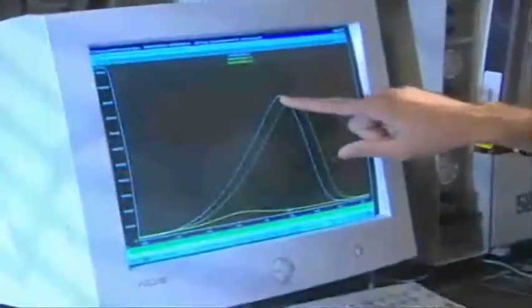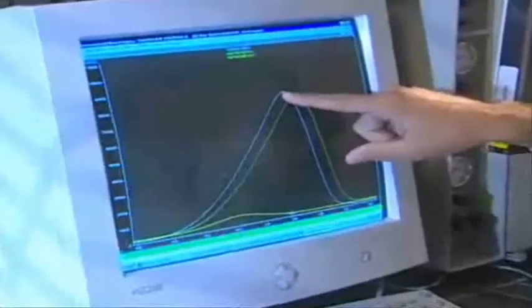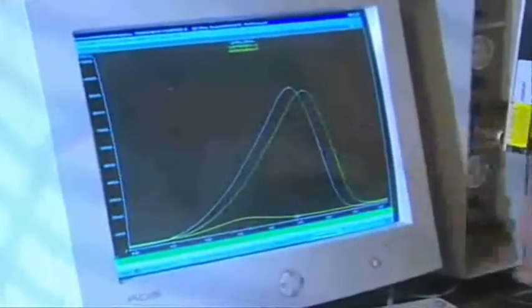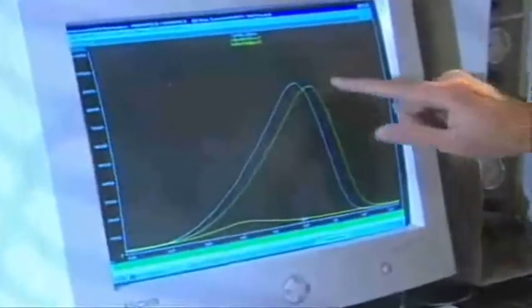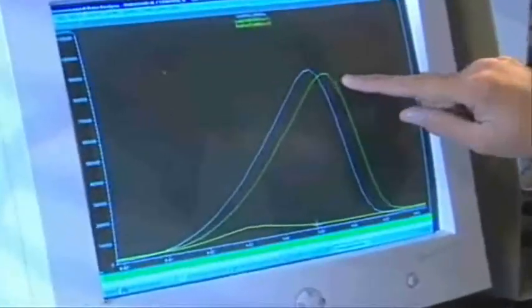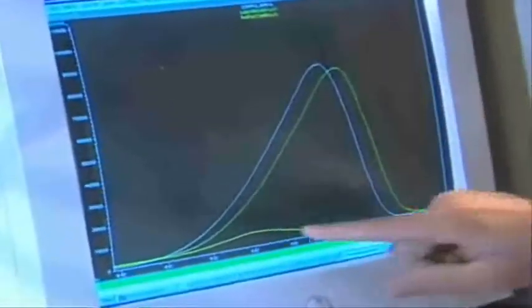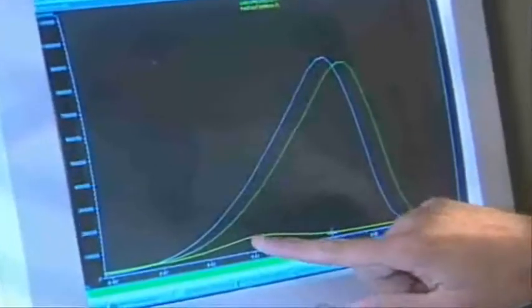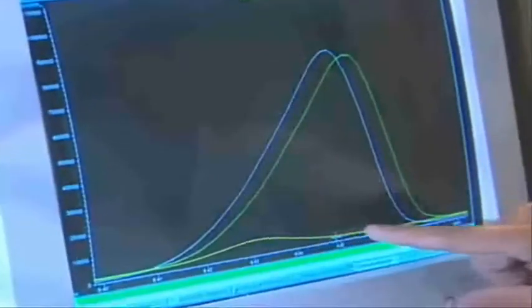This is our control: parathion in the solvent without any treatment. The second sample is parathion after treatment with the commercial absorbent. The third is parathion after treatment with FastAct.